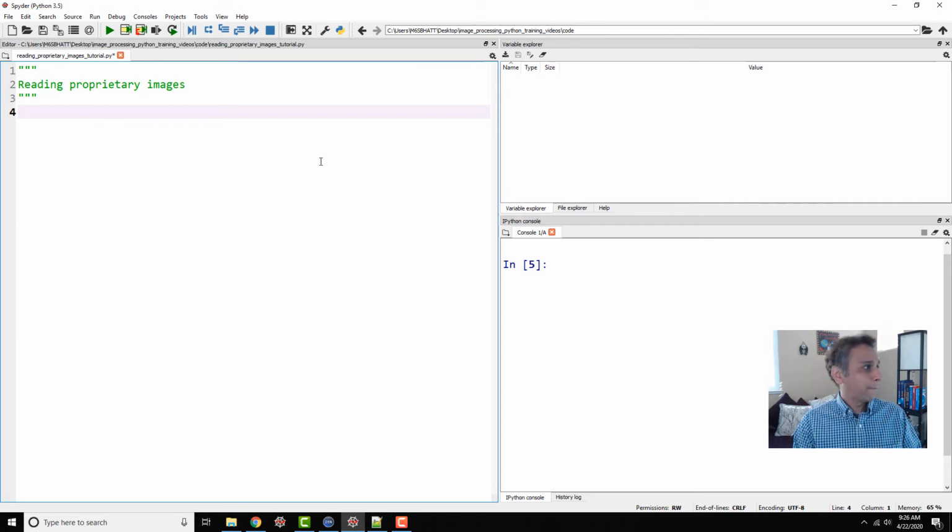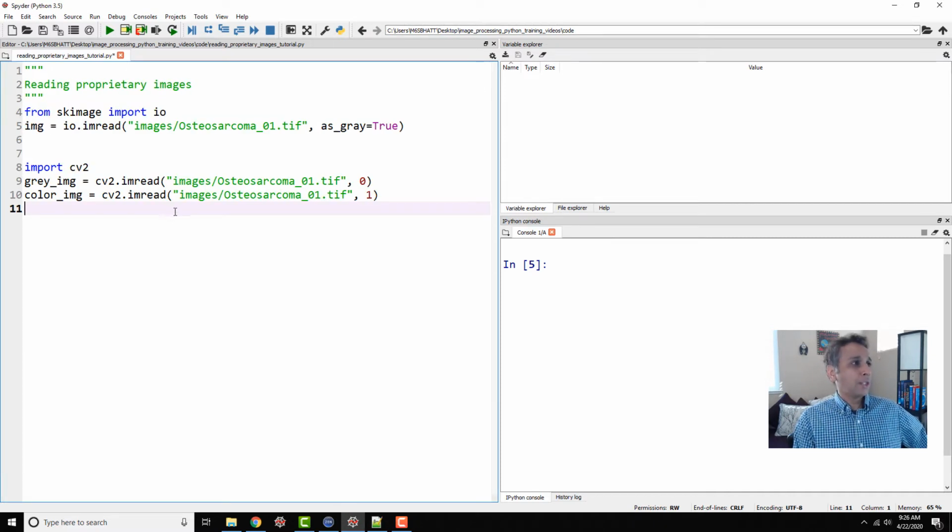So now let's first revisit how we opened .jpegs and .tiffs. Again, let me go ahead and copy and paste the code so it's easy for us to focus. So reading standard images is very easy. For example, even regular TIFF files like the one I just showed you, which is just a two-dimensional RGB image.